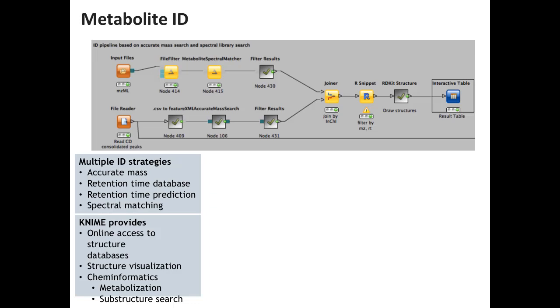Identification itself can be done with multiple strategies. Again, we will discuss that tomorrow, but to give you some idea of how it is done, of course, just sending the retention time and mass to charge ratio to your collaborators is one way. That's the easiest way. But you can also generate a table that gives them some hints of what is going on. How can you identify metabolites?